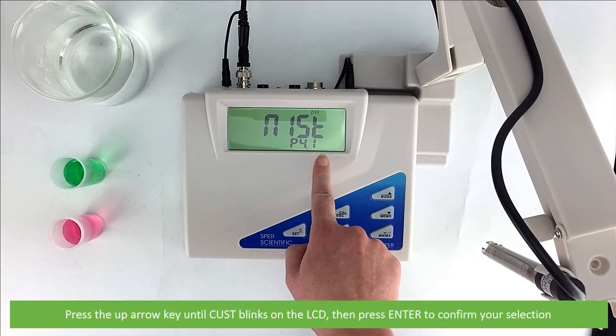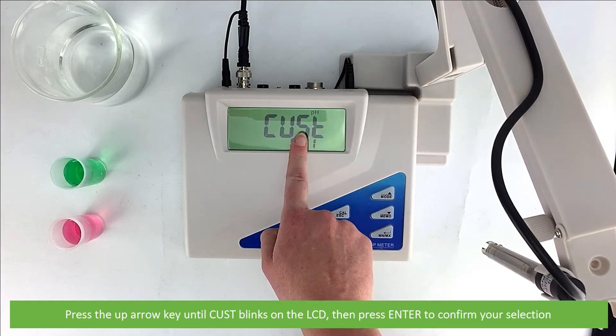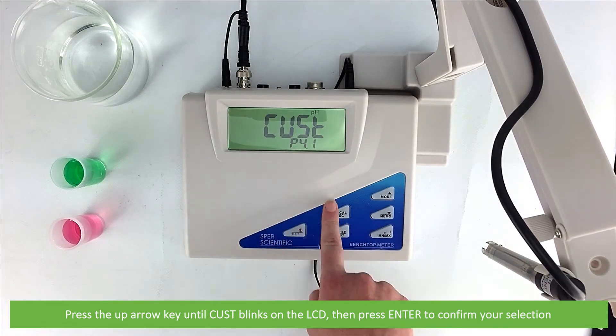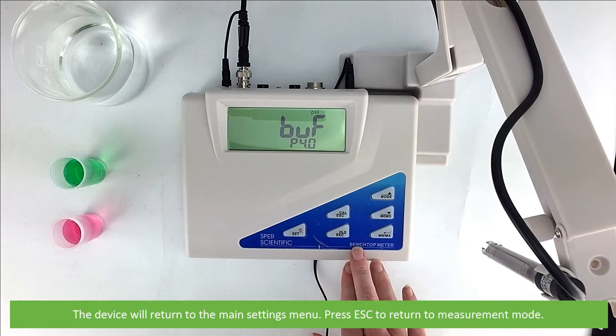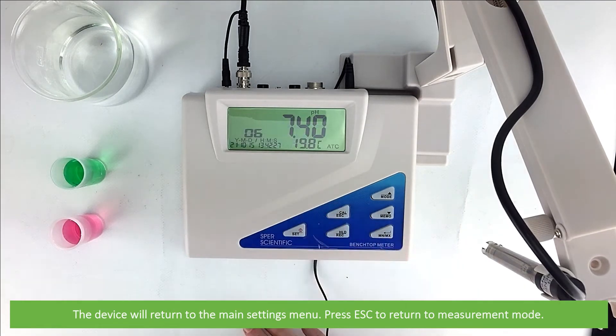Press the up arrow key until CUST blinks on the LCD, and press enter to confirm your selection. The device will return to the main settings menu. Press ESC to return to measurement mode.